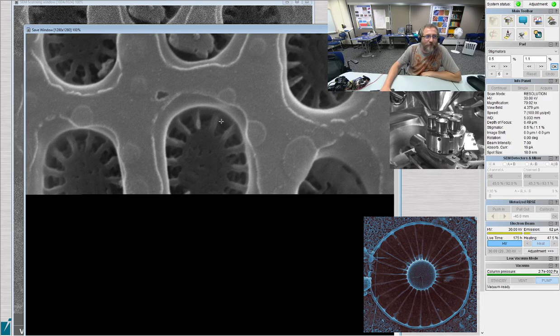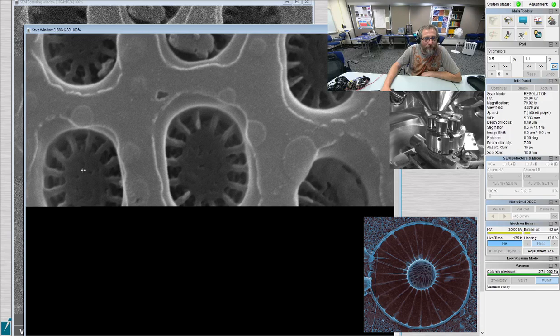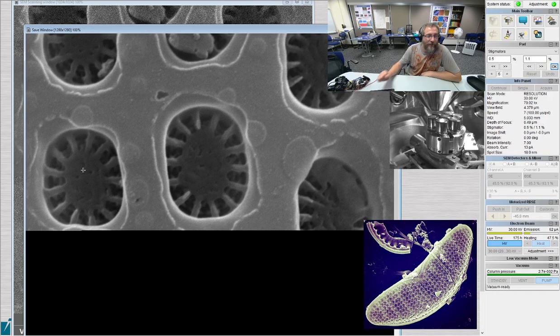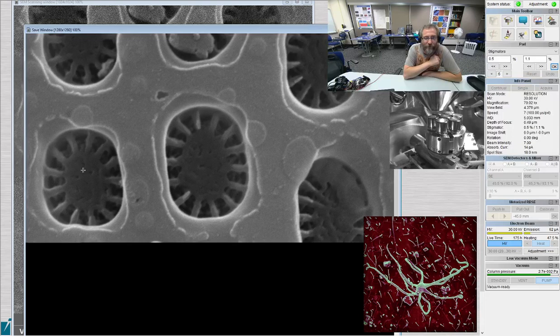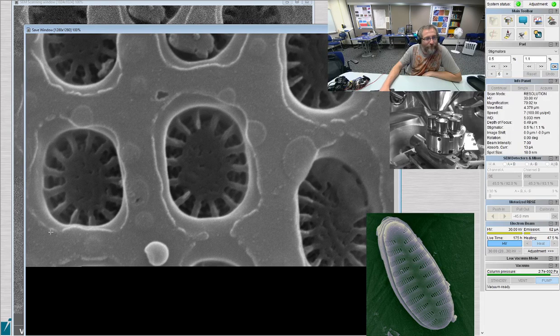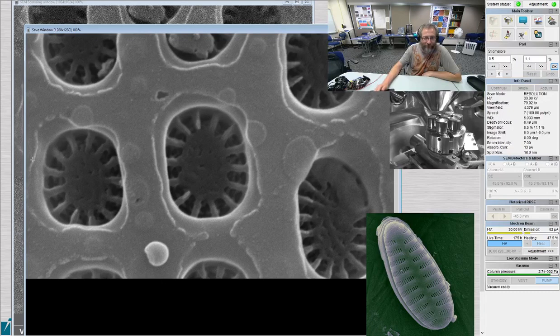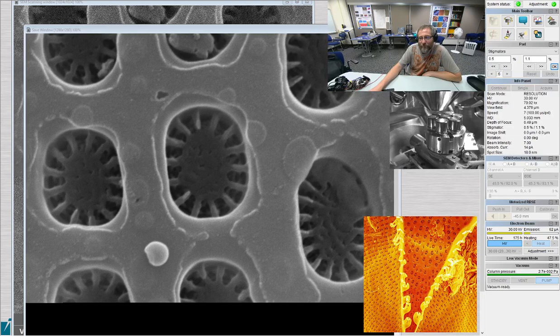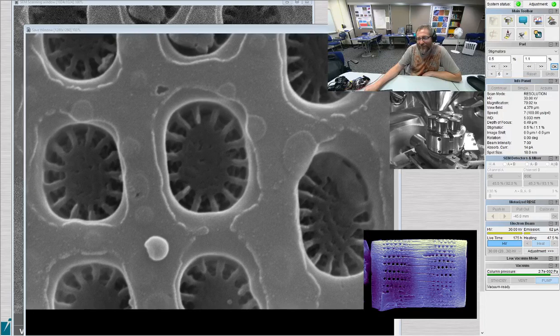That's actually a pretty good question then. Could a virus fit through that hole, or is it an antiviral defense mechanism? It could be. I mean, they have pore covers on there for a reason. They don't want to have an open passageway through the areola for things to get in like a virus. Yeah, so it could be big enough for water and nutrients. Smaller than fungus and virus, maybe. They do look a lot like a sieve or a colander, so maybe there's a reason for that. It's probably not an accident.